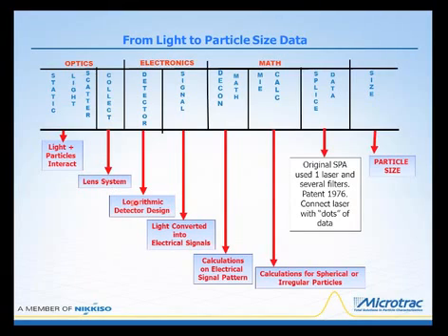We use a logarithmic detector array because the theories involved with light scattering really demand that. We could use what's called a linear array where all the segments are the same size, but there are some real issues with trying to do that. So once we have this light being detected, the light is converted into electrical signals, voltages, and currents. These electrical signals are captured by the instrument, and this provides the actual fingerprint for that material.